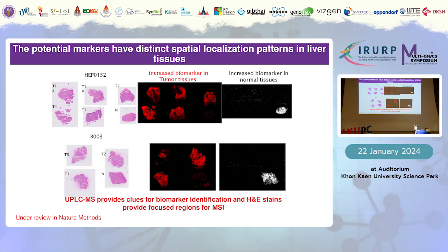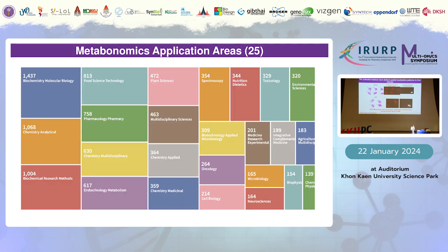But with this one, we only plot the metabolites that are only present in the control regions, that are absent from the tumors, that you can see. There's none from the tumors, it's all distributed in the control. This way, I think it gives you better interpretation of your mass spec imaging spectra.